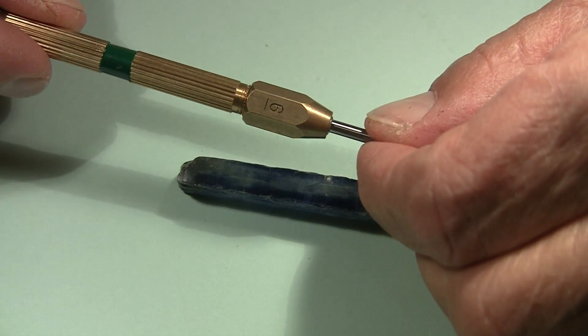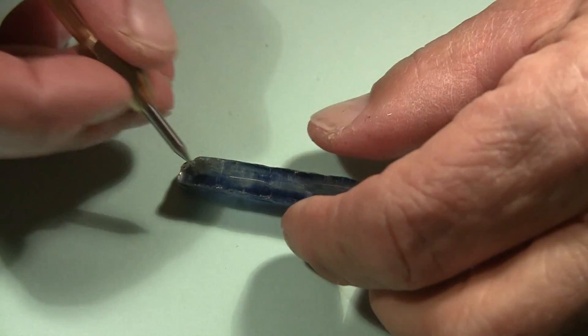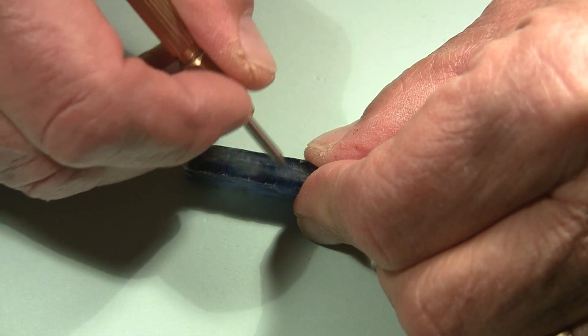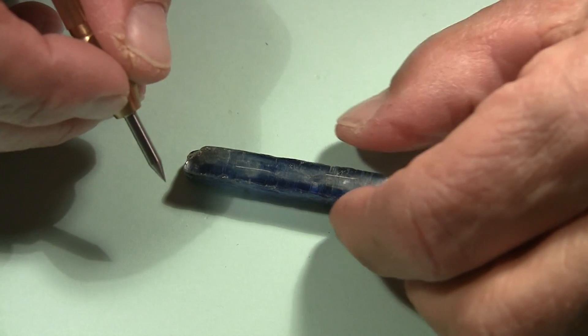I've got a hardness point here. This is the number 6. And in this direction right here, I'll try to scratch it. This slides across the surface there, not leaving a scratch.